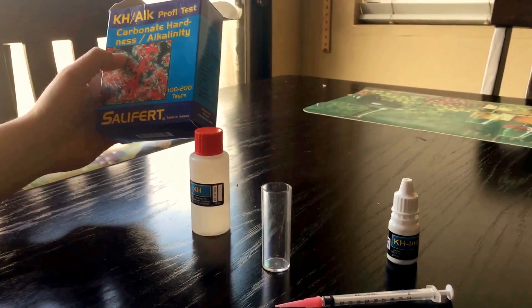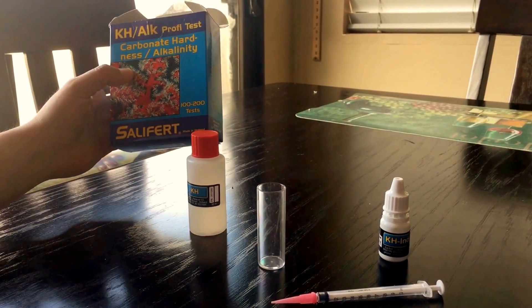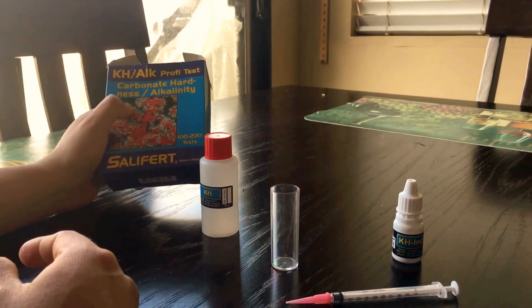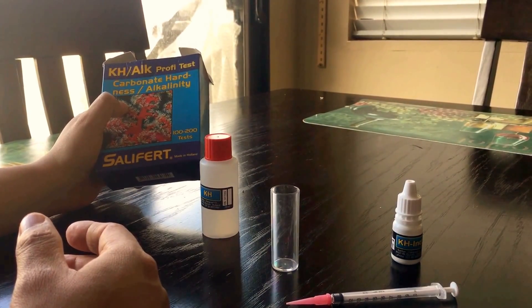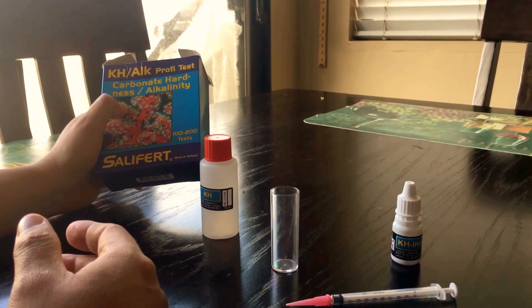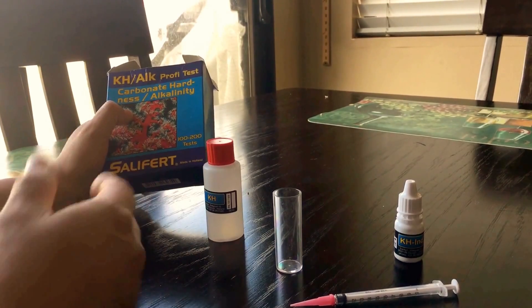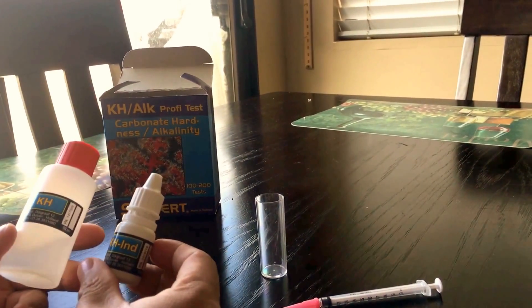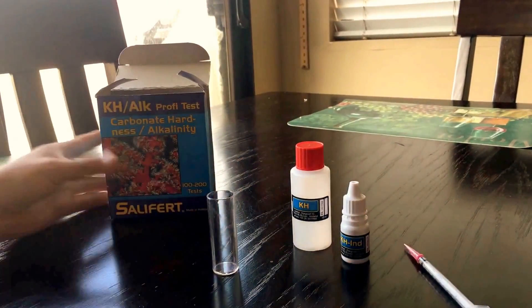Hey guys, how are you doing today? So today we are actually doing the alkalinity test. I use a Salifert test kit — it's a really good test kit. I used to use IPA or something like that, but I switched to this because I think this is more accurate. It's very simple to use — you just have two syringes, this one and this one.